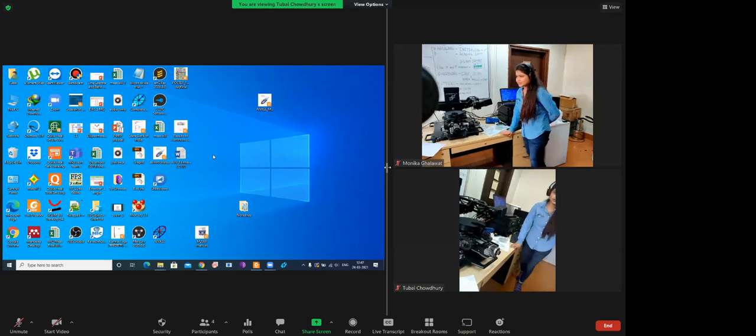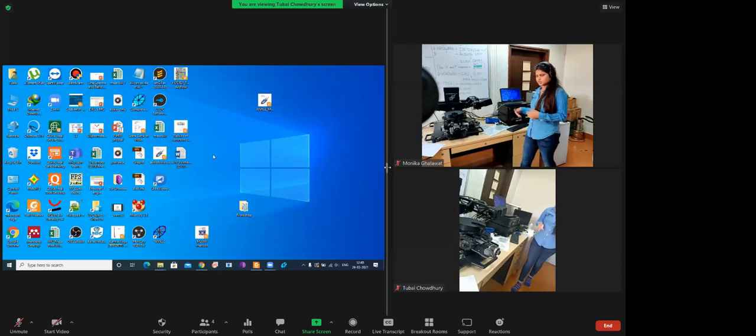So I think many of you are using Complete Ease on your laptops or desktops, so you must be familiar with it. But here we are not showing the initialize part, where we connect our hardware with the software, because we don't have the key for Complete Ease. It's an old model, an old instrument, and the configurations are not matching. We tried multiple times, so we will only elaborate on the analysis part.